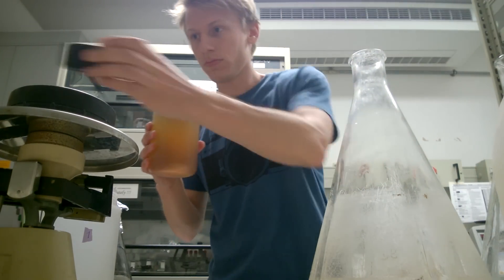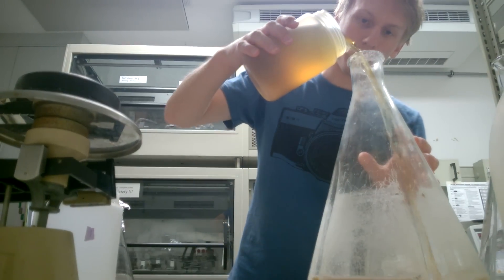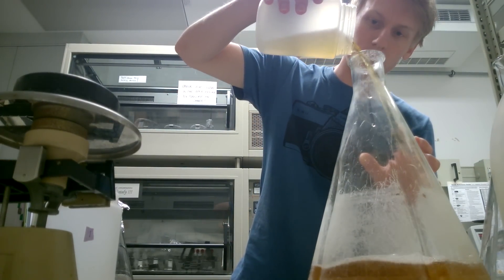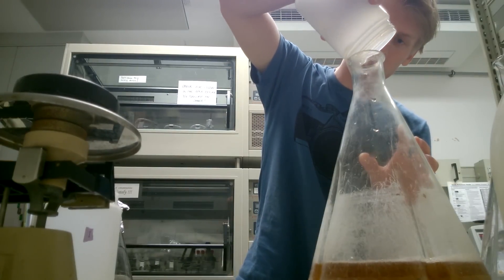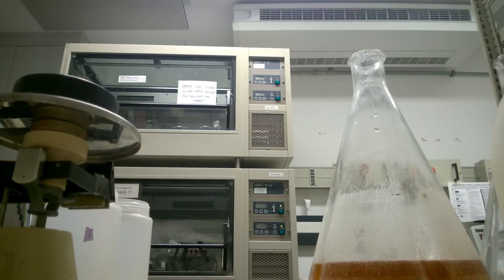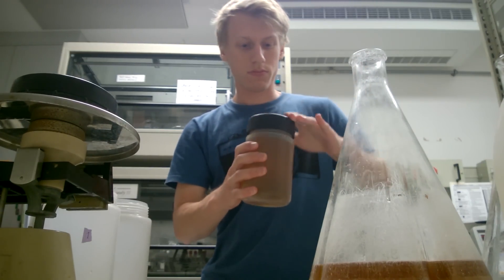This stuff is usually quite a mess to deal with because just pouring these liquids from one container to another, there are always driblets around and it's really really sticky stuff. The medium is a little bit like jelly — not really, it's still quite a liquid — but it's sticky like fruit jam in the morning. If you put your hand in it, it sticks everywhere. It's kind of gross, but you can wash your hands afterwards.